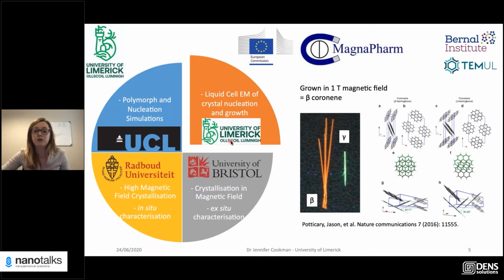And then of course we've got us in the University of Limerick, and we focus on the liquid phase electron microscopy characterization of these crystals and observe the crystal nucleation and growth. And then what we do have to consider in a conventional setup with an electron microscope, because you do have a construct of the electromagnetic lens, you do have automatically an induced magnetic field. So part of my work I do to extract the information about the magnetic field capability is we have a collaboration then in the Ernst Ruska Center in Jülich to do the magnetic field free experiments to then compare what we get in a conventional setup.